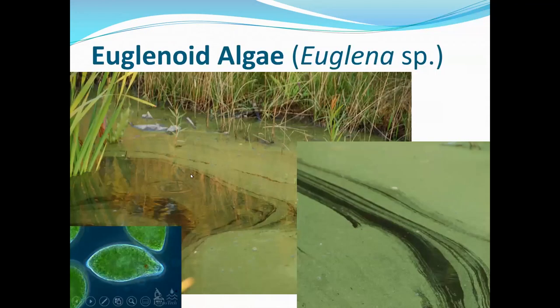So this is euglenoid algae, and this is true Euglena. There has been a bit of a split in Euglena in that they've moved a bunch of them to Lepocinclis. If they're metabolic, in other words, if they can move, they stayed in Euglena, and this material came from this bloom, and it was shape-shifting. So this is Euglena. And you can see that right below the surface here, not right at the surface, and where it is at the surface, the water's quite clear underneath. Actually, underneath this was some Trachelomonas, so when you pulled that water up, it looked almost black, because that incorporates iron into the lorica.